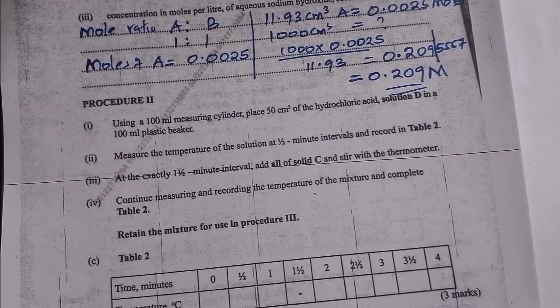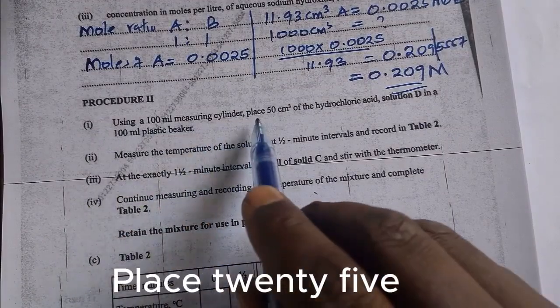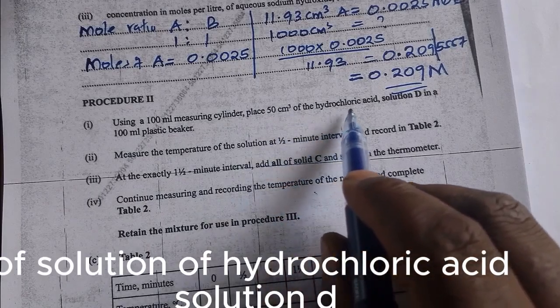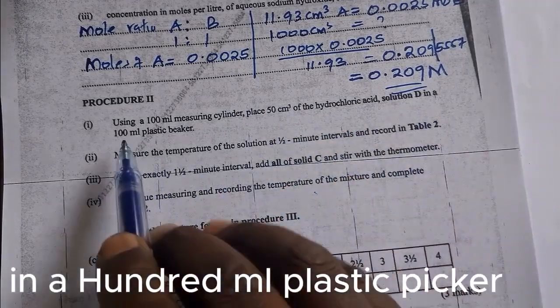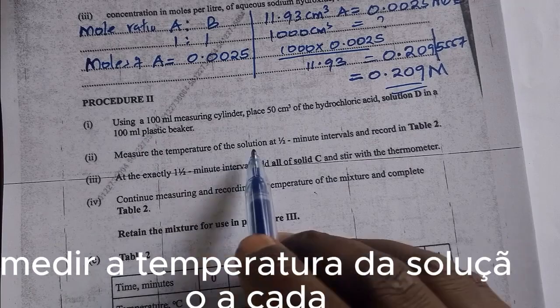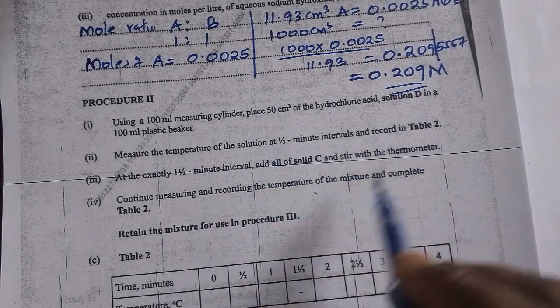Procedure 2. Using a 100 ml measuring cylinder, place 50 centimeters cube of solution of hydrochloric acid, solution D, in a 100 ml plastic beaker. Measure the temperature of the solution at half-minute intervals and record on the table. We have the table here.